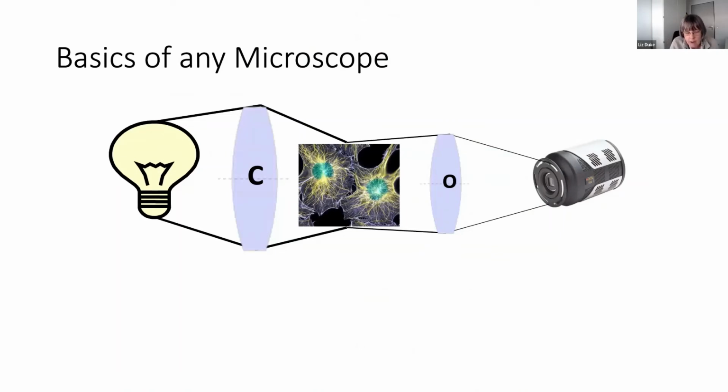But one thing I would highlight is that fundamentally every microscope is the same, be that an electron microscope, a visible light microscope, or an X-ray microscope. They all require some form of source of particles, be they X-rays, visible light photons, or electrons. They then need to have some way of focusing those electrons, X-rays, or visible light photons down onto the sample, and then collecting the X-rays, which are then focused onto a detector.